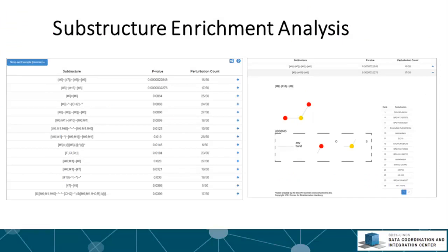This can potentially enable the design of small molecules with desired properties. This is the result of the substructure enrichment analysis, which is displayed in a table where each row is a significantly enriched chemical substructure. Each row provides three pieces of information: substructure, p-value, and perturbation count.